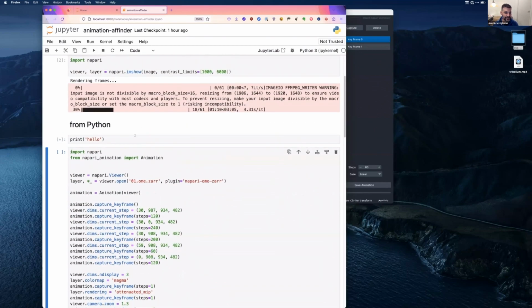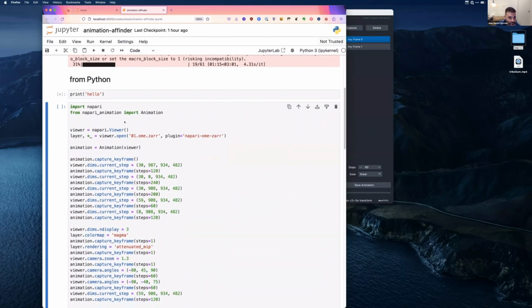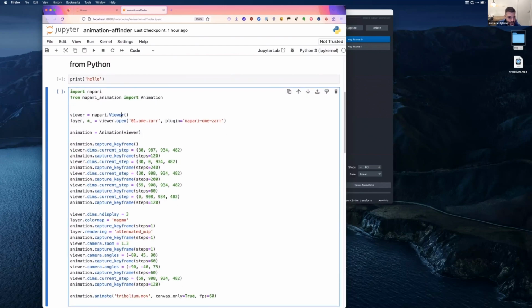No, I don't know what magic it's doing that the kernel thinks that it's idle, but it's actually blocked. But anyway, okay, I'll just go to this code while that's running.